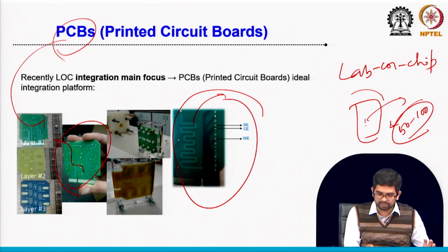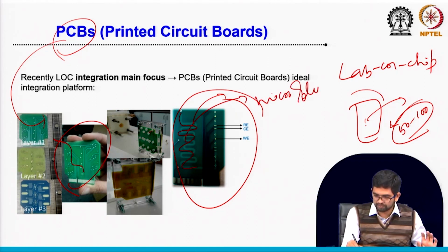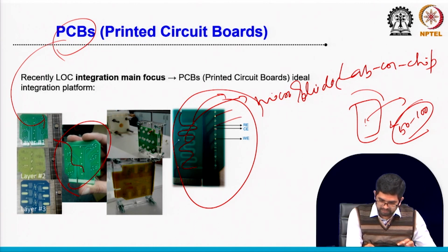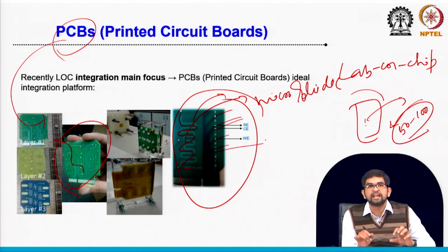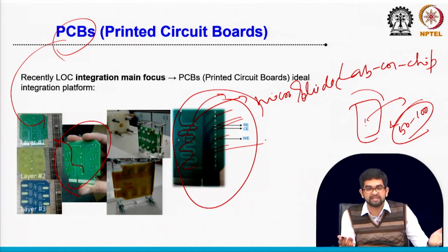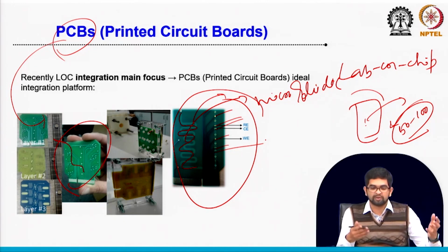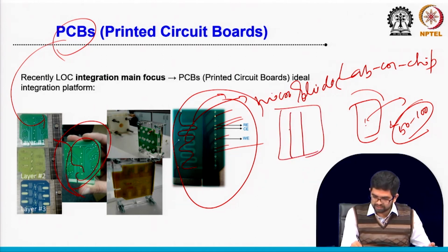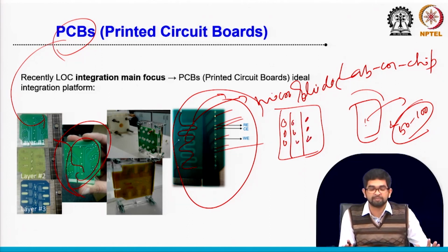You can see on the right hand side I am showing one PCB. Here, see the channel. This is a simple microfluidic channel. And you can see here this is the spot. All these spots we can use as electrodes. With a PCB designer, you can easily compose your own design. If you need something this way or that way, or maybe you need multiplex detection, like one chamber here, one here, one here, that also you can design. It's completely up to you.